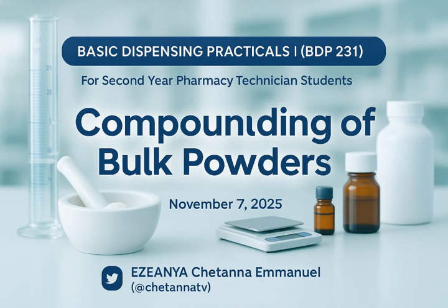Because, you know, if you are mixing powders, be very careful as you mix. Not just powders alone. Anything you are mixing. Do you know why? Mixing is a very important step in any preparation you are doing. If you make a mistake in your mixing.